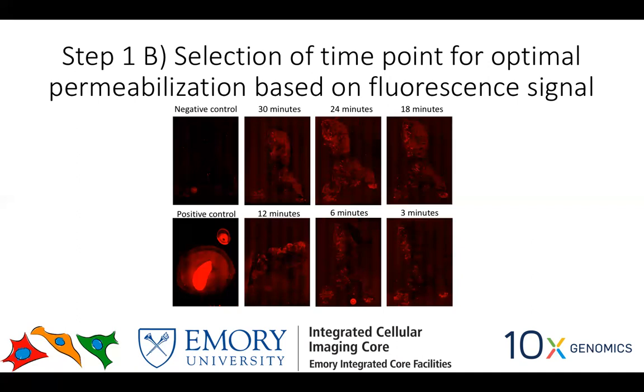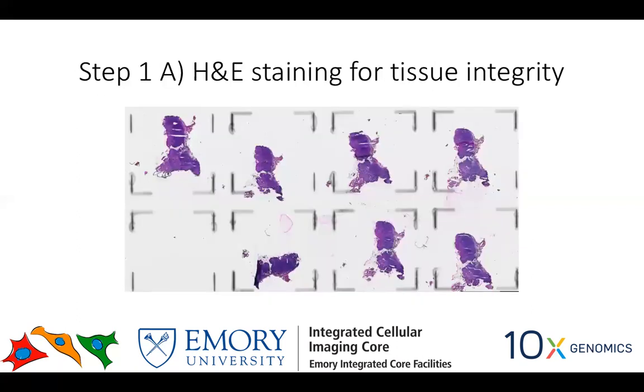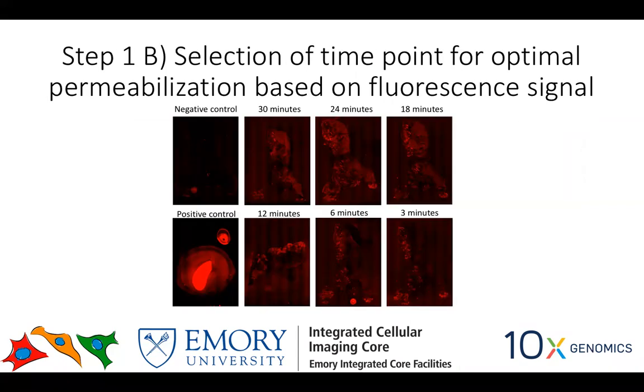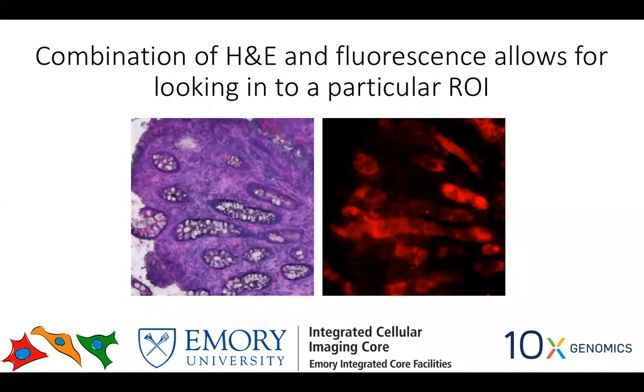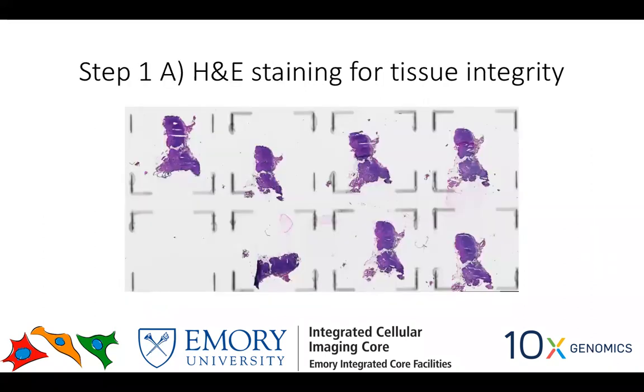But how long do you think it typically takes to go through the optimization slide and then move on to the next one? It's a day-long thing. So step 1 is a day-long thing, and once we know the permeabilization time, then you can start your step 2. Okay, so I'll have to book time with you guys 2 days in a row, right? Exactly. And Laura will take care of that. If you let us know what days you want to perform these experiments, Laura can block those times on Lionheart and help you out. Okay, sounds good.